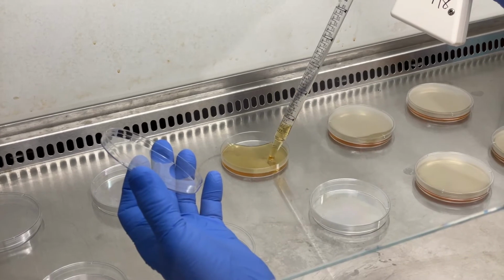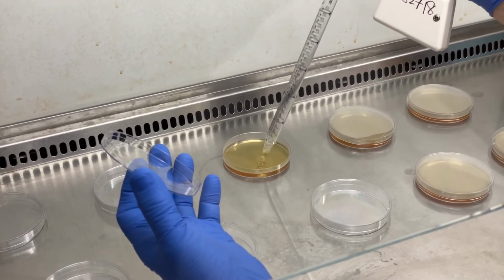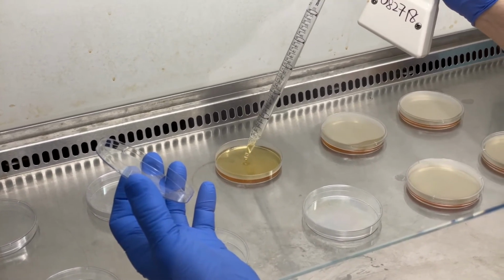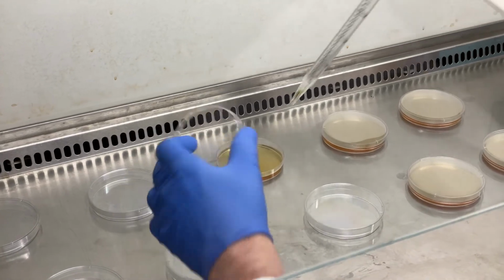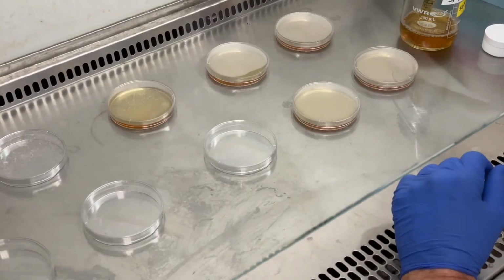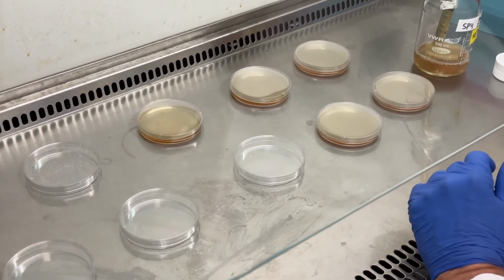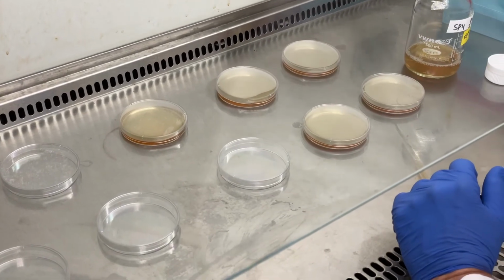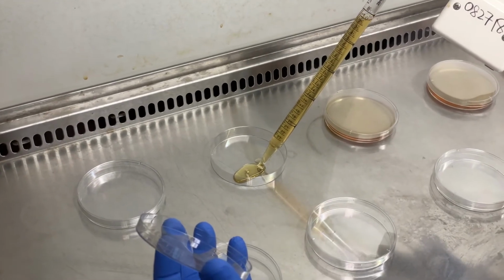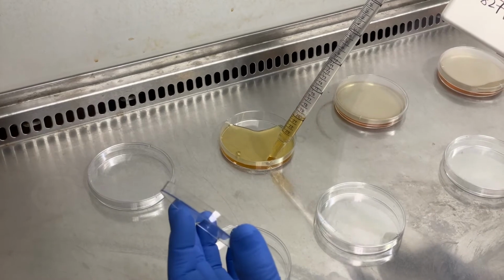These plates should be poured, of course, on a flat surface so that the depth is uniform around the petri dish. They will essentially set up in about 5 minutes at room temperature, and they will be cooling, and you'll see fluid condensing on the lids as they cool.